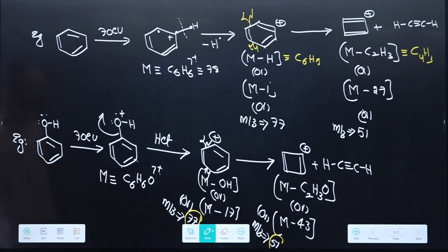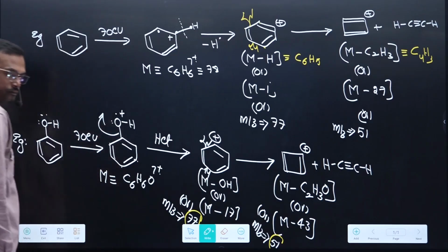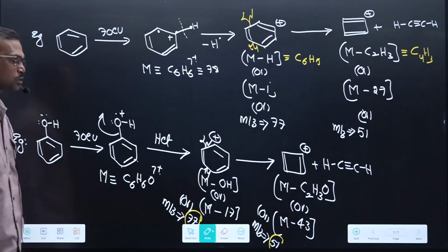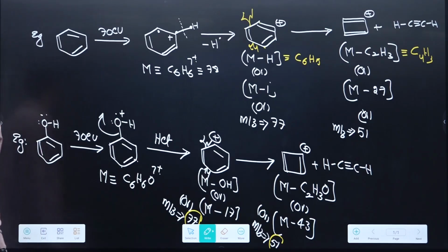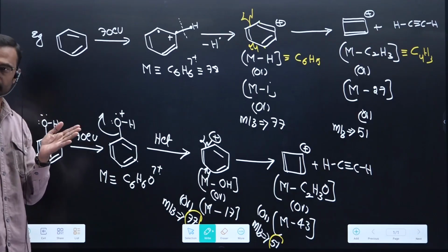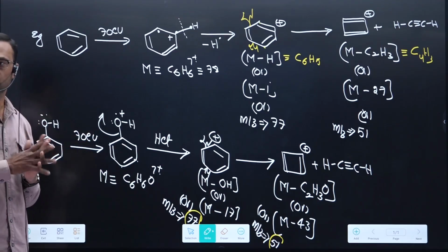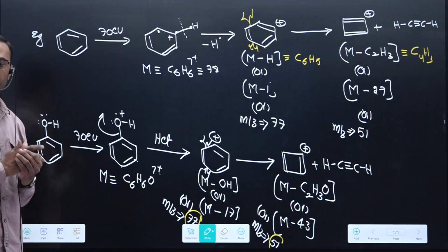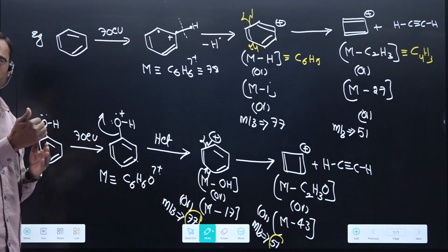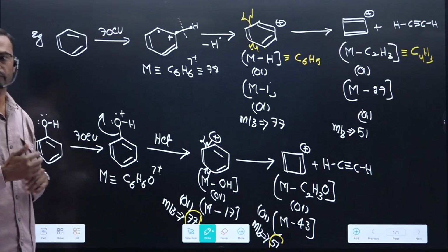So that is a representation of a fragment. Clear? So two major concepts we learned today, especially for fragments: how to make fragmentation, and how to represent a fragment ion. Initially we learned what types of fissions there are: homolytic and heterolytic. Later on, what is fragmentation, what are the steps required for fragmentation, and how to represent a fragment. So the next concept is types of ions.